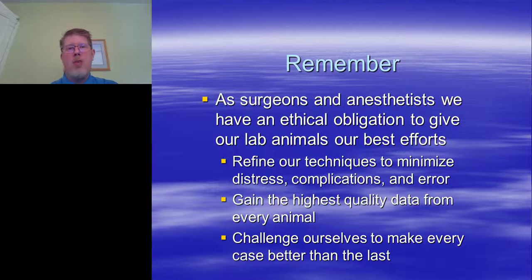But if you're working with surgeons, make sure they're doing things right. Because if they're not, broken record, I admit it, but your data is compromised. And it's a cliche, but it also happens to be true in the lab animal surgical field. How I do my work will affect the study. And after a while, ethically, we do this, but the saying is, you tell me what results you want, and I can do the surgery in such a way to maximize the chance that we get them. We should be doing it properly.